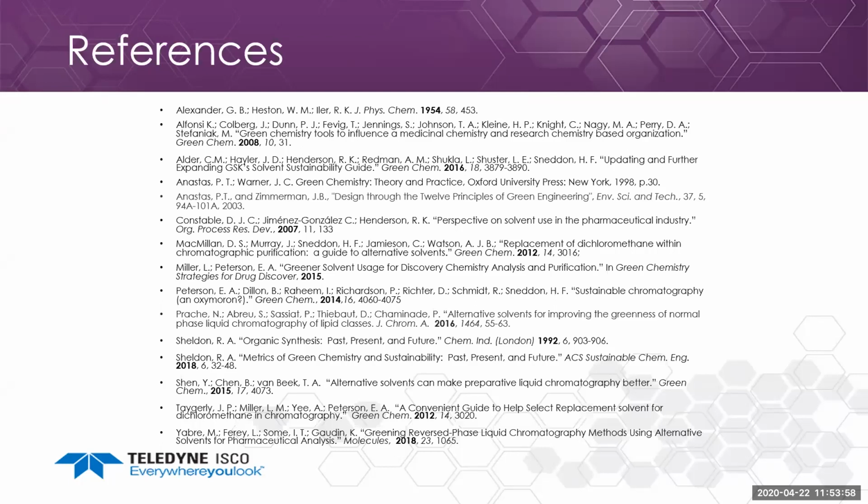And then let's see here. Are there any advantages to using triethylamine versus ammonium hydroxide in systems with ethyl acetate or ethanol and heptane for amines? Whenever I tried to purify amines, I always liked to use triethylamine. It seemed to behave a little bit better. For these examples, they used ammonium hydroxide and didn't have any issues, it seemed like.